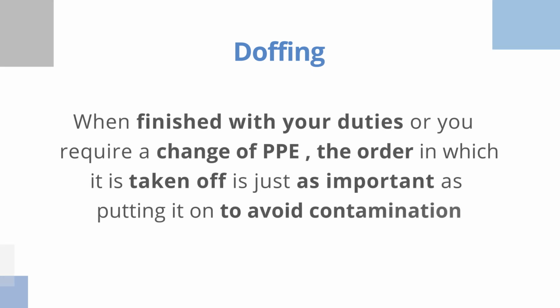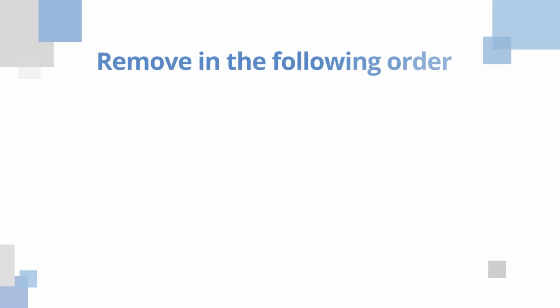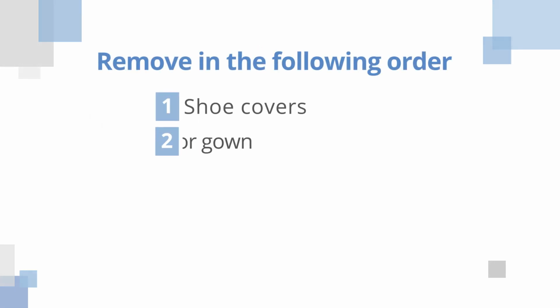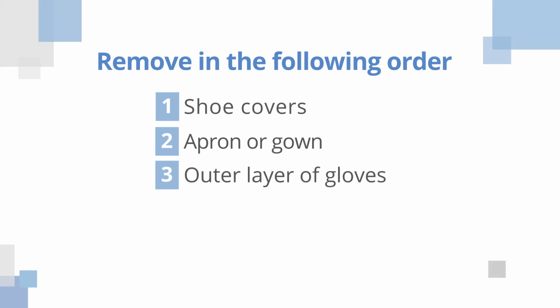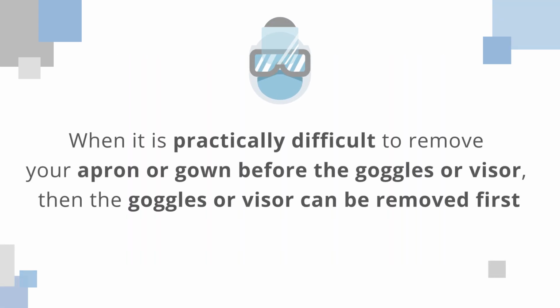If you are finished with your duties, or if you require a change of PPE, then the order in which it is taken off is just as important as putting it on to avoid contamination. First, remove your shoe covers, apron or gown, and outer layer of gloves, goggles or face shield, and lastly your mask. When it is practically difficult to remove your apron or gown before the goggles or visor, then the goggles or visor can be removed first.